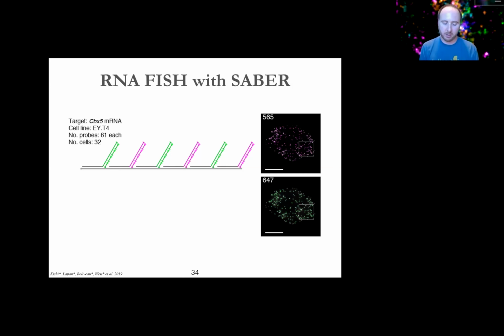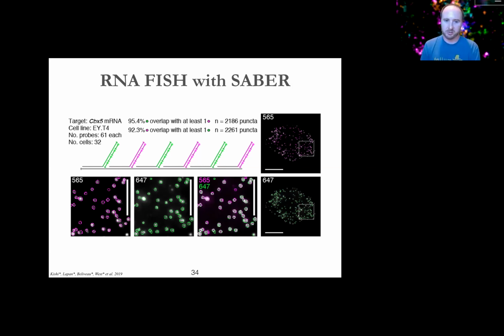And the answer we get is phenomenal. We're getting 92, 95% overlap of the puncta, depending on which one we use as the reference channel. And these numbers are absolutely stellar for this kind of assay. I think the rate limiting step ends up being the segmentation itself. So we feel very good that the SABER approach is maintaining the inherent fidelity of either our single molecule FISH technique or our Oligopaint technique when we use SABER on top of it. And I think, honestly, the real power of SABER in some ways comes from its multiplexing and not its amplification, but they're related. So I'm going to explain that quickly here as I finish up.